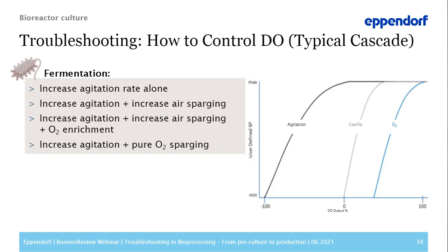So, how do you control your DO? A typical way to ensure sufficient oxygen supply to the culture is displayed here in a 3-step control. Gassing with pure oxygen from the beginning would be possible and would honestly give you much quicker results. However, it is also very expensive.